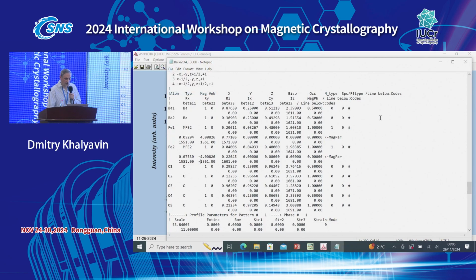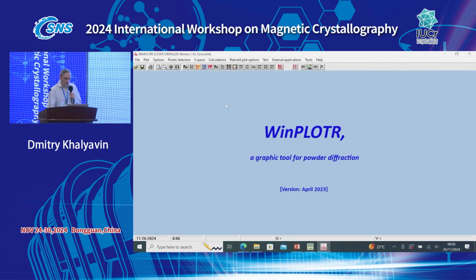Okay, we can try now to run again. Well, we can fix some, definitely. Let's run it like that first. Let's see what will happen.